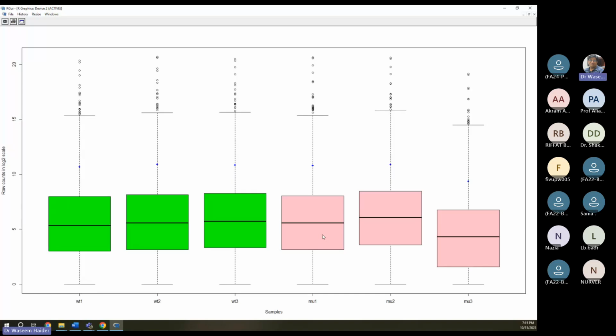What does that mean? The overall distribution tells us that 50% of the population has counts like 38, 39, 40, or something around 38 to 40, right? But the means were something like 1600, 1700, 1800, and so on. Why? Because we have those big data sets in this number. So that means this distribution is highly skewed, to the right or to the left. If you have covered the stats part, skewness, that we cover in first term, so the distribution is skewed, right? These are not perfect bell-shaped curves.